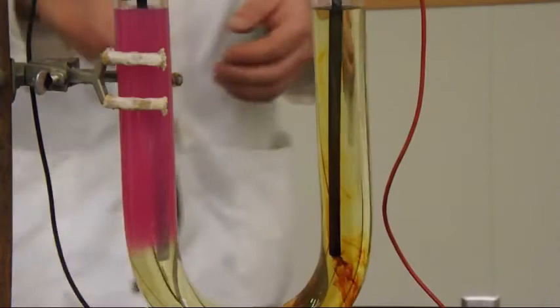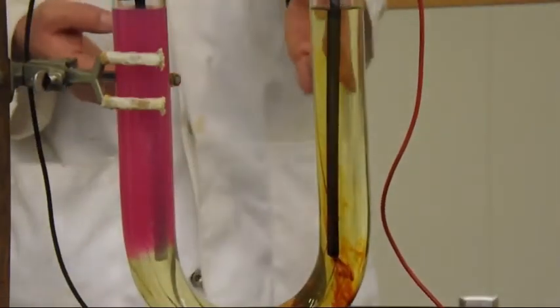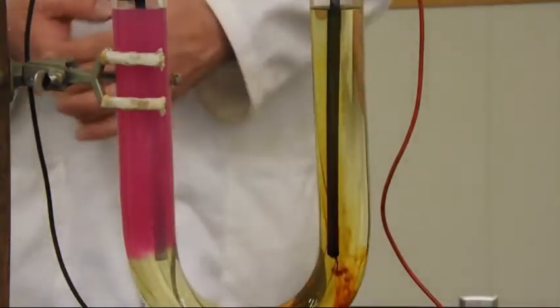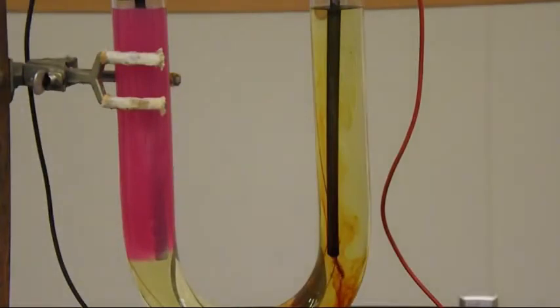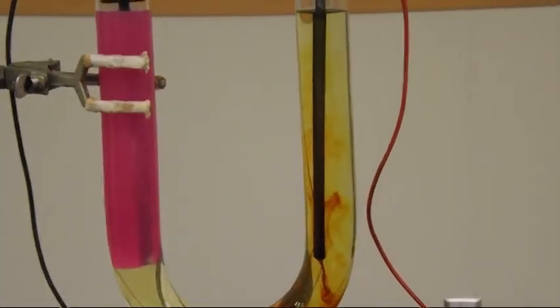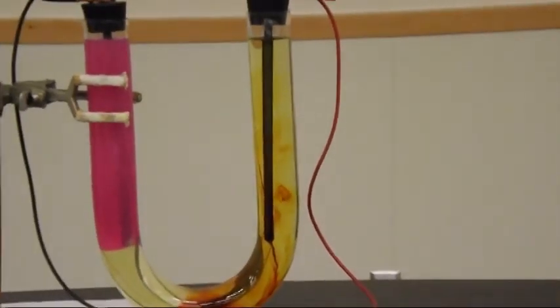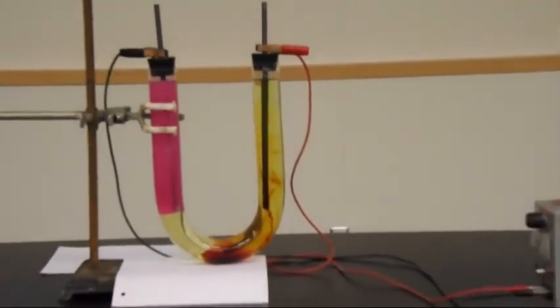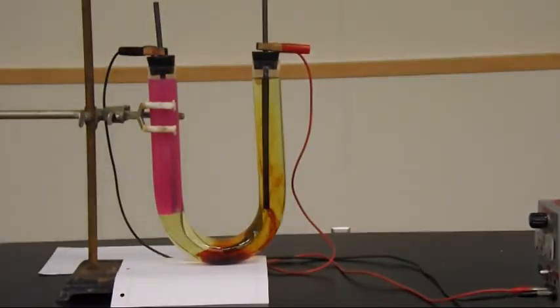So off of the one electrode we've got a gas bubbling off and a basic solution being formed. Off of the other one we've got a brown iodine solid being formed as it goes down. So just going to zoom this out just a tiny bit. You can see the entire cell setup in the region right there. So what's actually occurring?